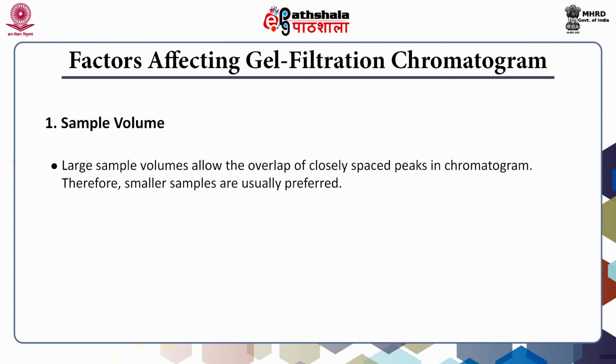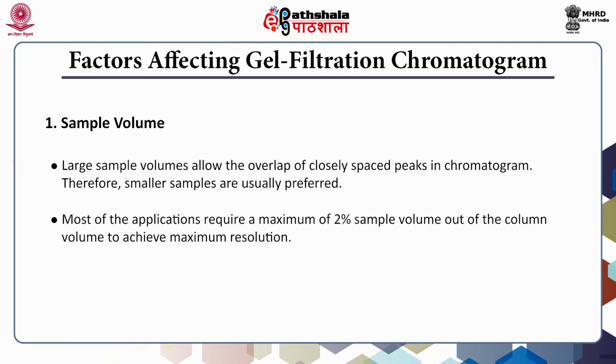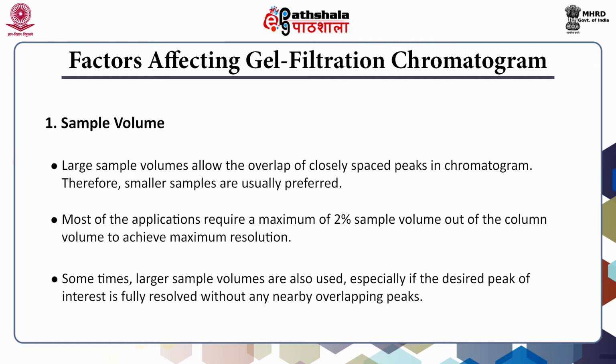That means different molecules can be separated very clearly. Most of the applications in gel filtration chromatography require a maximum of 2% sample volume out of the column volume to achieve maximum resolution. Of course, in some books they have written even 5% bed volume. Sometimes larger volumes are also used in gel filtration chromatography, especially if the desired peak of interest is fully resolved without any nearby overlapping peaks.